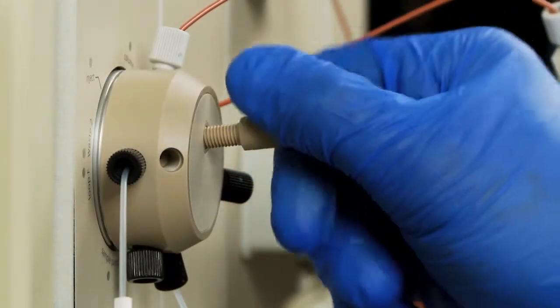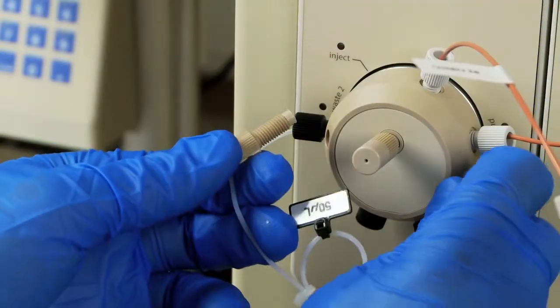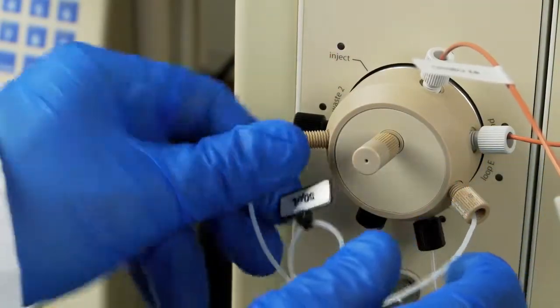Attach the injection port to the front of the inject valve. Attach the sample loop to the ports labeled loop E and loop F.